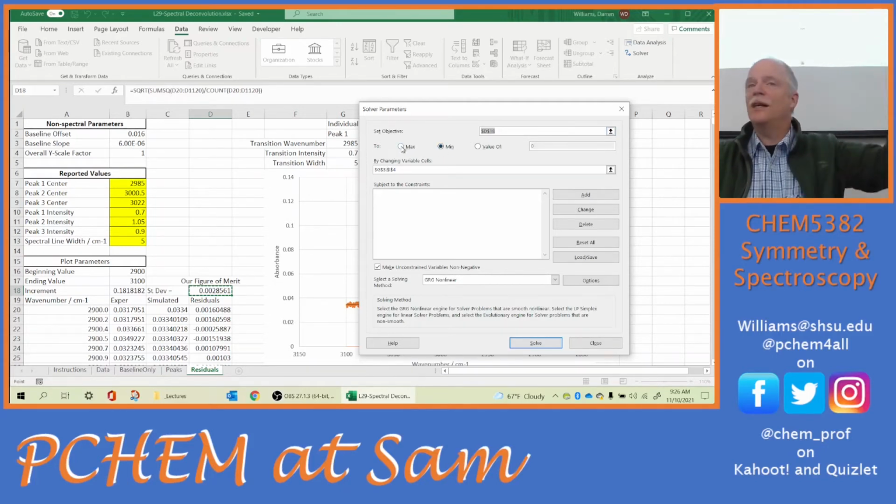Maybe you want to maximize something. Maybe your fit is, high is better. Okay. It depends on your figure of merit. Ours, we want to minimize the standard deviation. So we're going to set it to minimum. Don't say 0. One, you're never going to attain 0. And two, since you can't attain it, it will say, sorry, we couldn't find a solution.